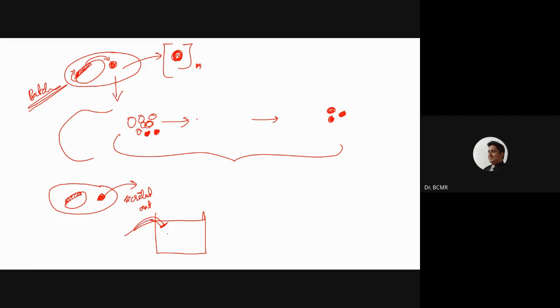So the bacteria are growing and secreting the protein outside into the medium. So I take the medium, I can centrifuge out the cells, take the medium, and now I have the medium along with the protein. And all I need to do is isolate or purify the protein, right?